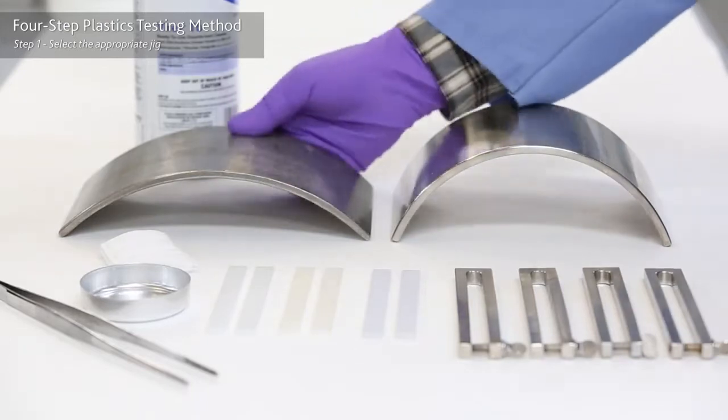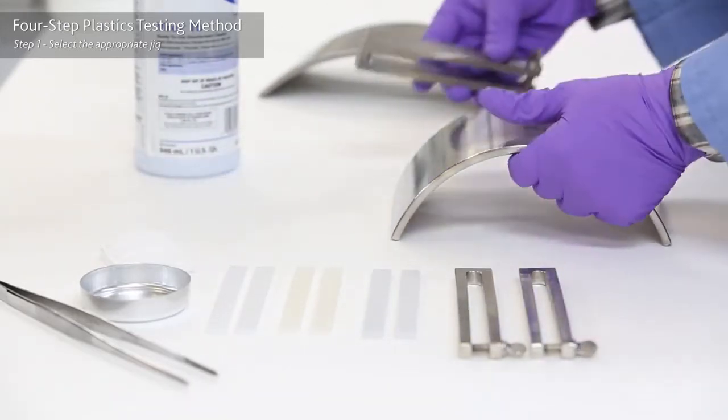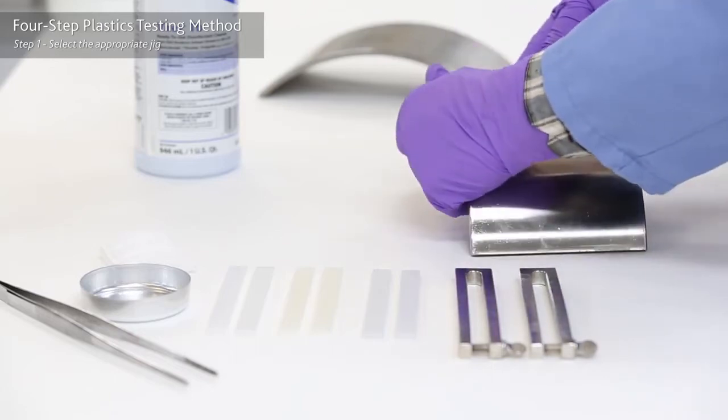Step one: simply select a jig with an appropriate strain level. To accelerate environmental stress cracking, we choose 1.5% strain.